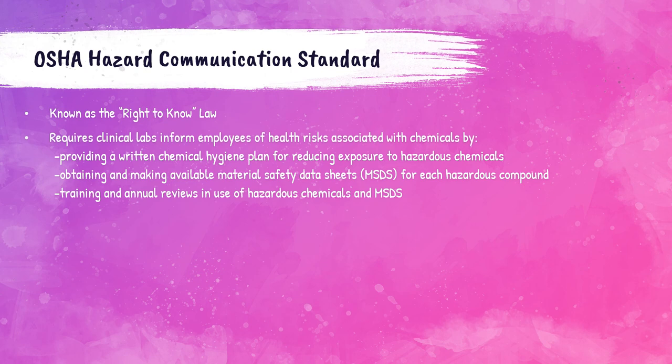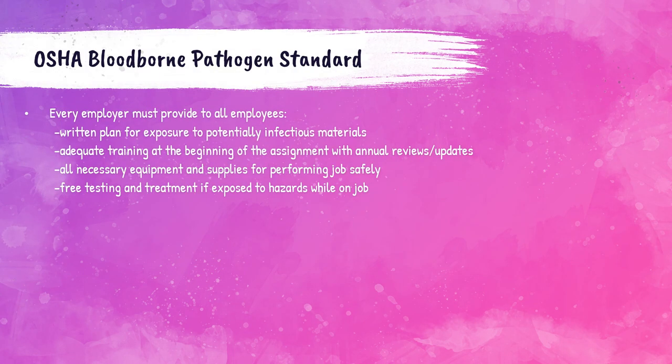The OSHA Bloodborne Pathogen Standard requires that employers provide all employees with a written plan for what happens if an employee is exposed to potentially infectious materials, adequate training at the beginning of employment as well as annual reviews, all necessary equipment and supplies for performing a safe job, and if an employee is exposed to hazards on the job, the employer must provide free testing and treatment.